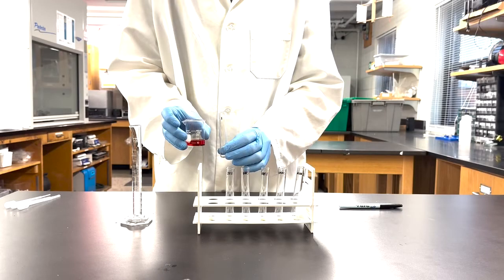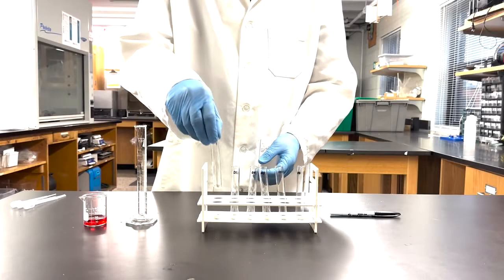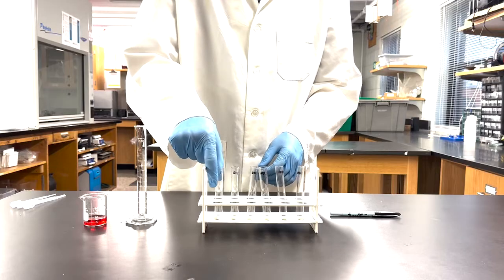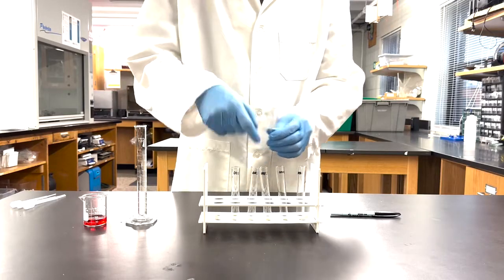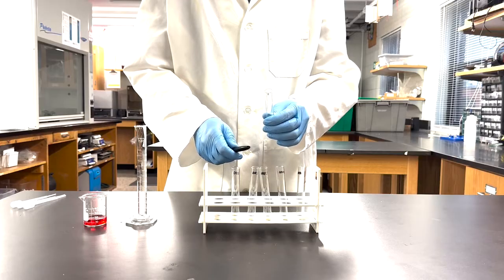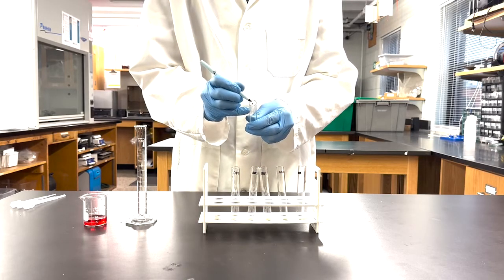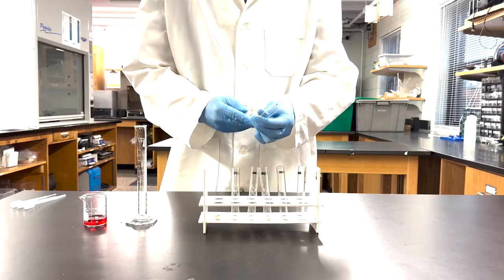To perform a serial dilution, begin with a stock solution to be diluted. Determine the desired dilution factor. 1 to 10 is a common dilution factor that creates a logarithmic dilution, but other factors can also be used, such as a 1 to 2 dilution where each solution is half as concentrated as the previous solution.